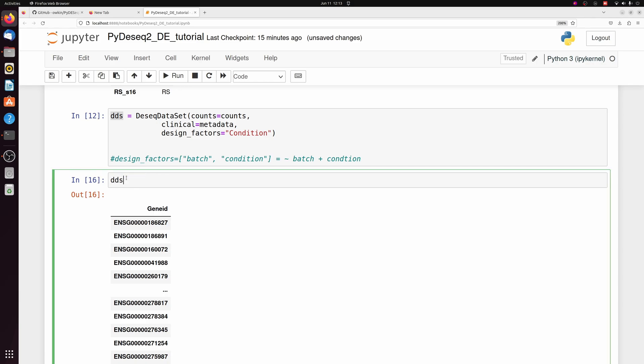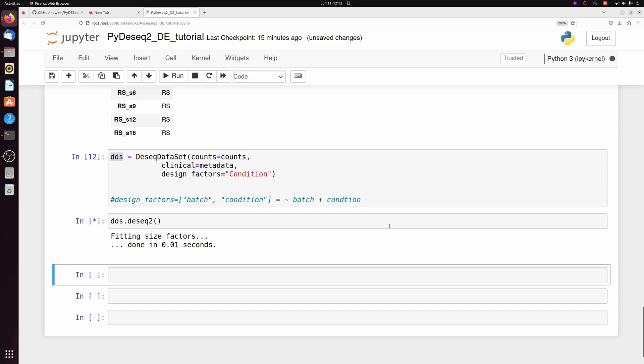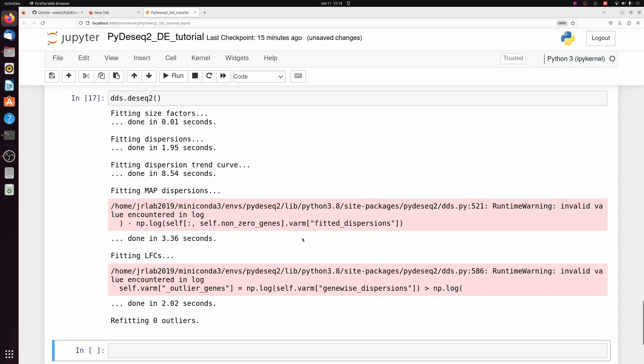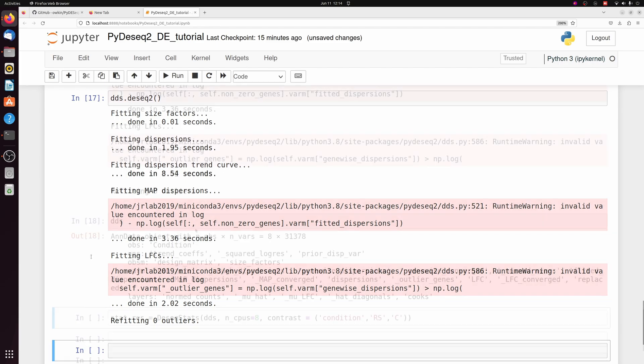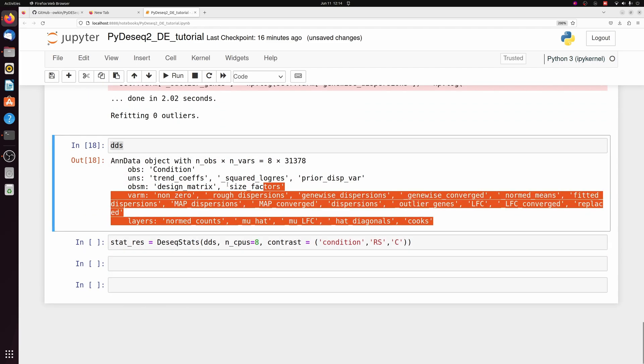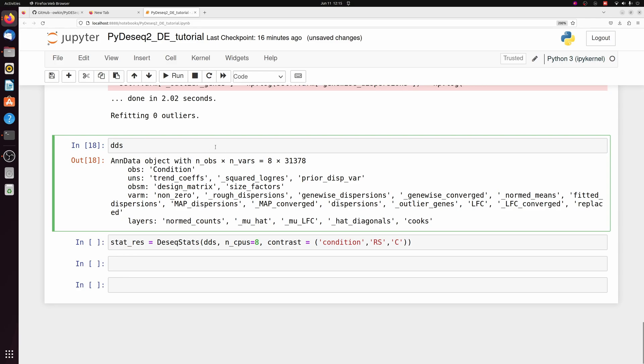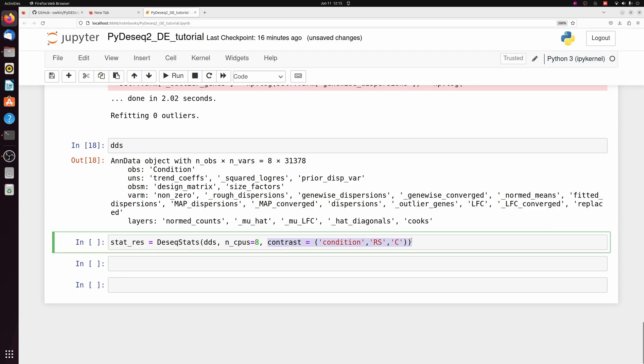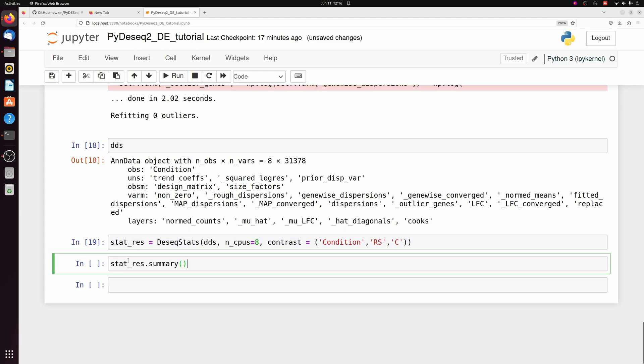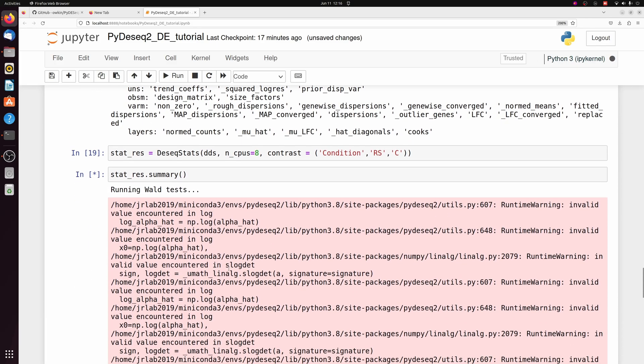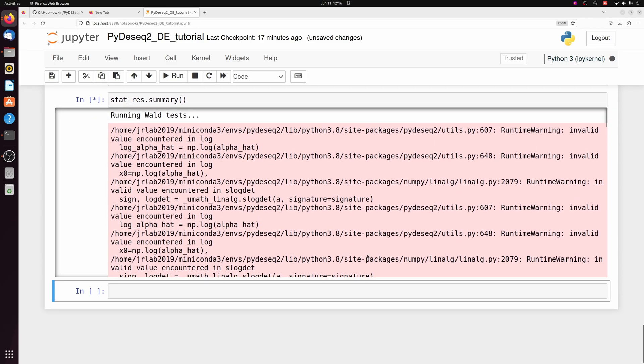But anyways, we can actually run DEseq2 now like this. It does give a lot of output, which for the most part you can just ignore. So running the dseq2 just added a bunch of statistics to our DDS object, which we can now use to find our differentially expressed genes. And this contrast is going to be similar to what you're used to in dseq2 in R. We're specifying that we're comparing RS to C because RS is first here. And of course, we're using the condition column. So we set this, but to actually calculate it, we need to do the .summary function on it.